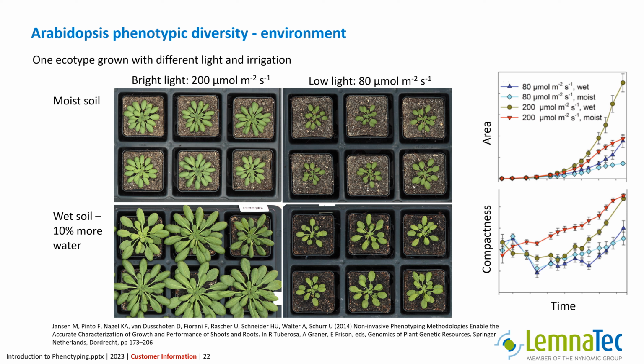The plants having low light from the beginning start growing slow and speed up the more leaf area they grow. The other plants having bright light are growing fast from the beginning, even at low leaf area, but then they slow down growth because the soil moisture becomes limiting.